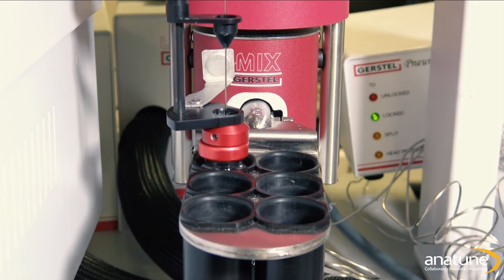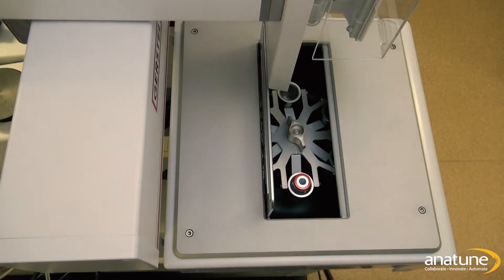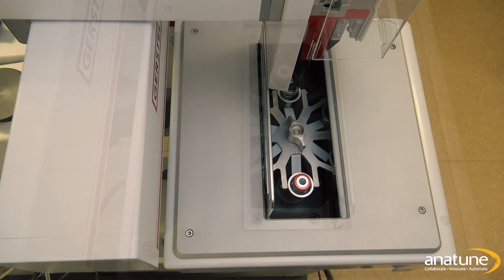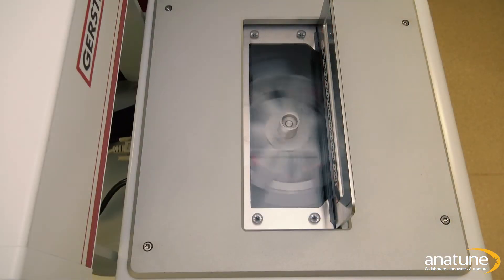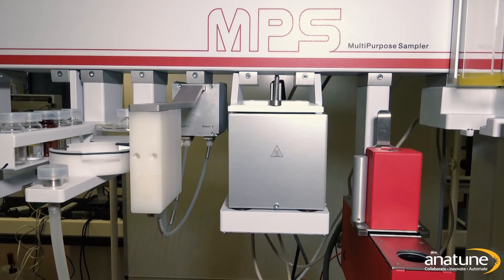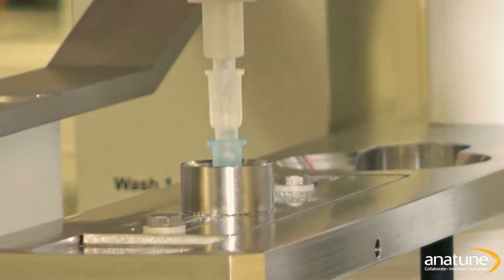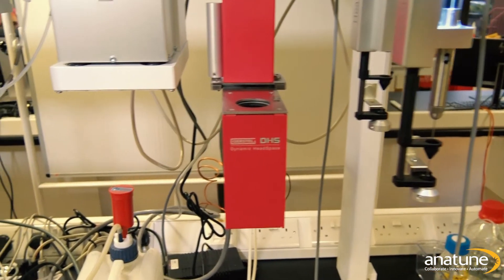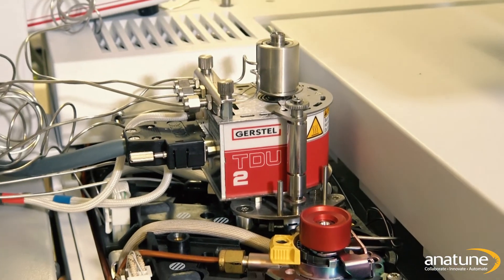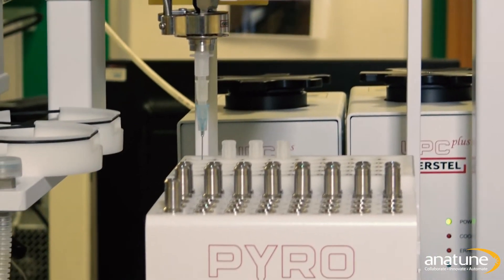That is where the Gerstel MPS comes in. This robotic rail offers the widest range of possibilities for automating the extraction of volatiles and semi-volatiles. It can easily perform almost every stage of sample preparation including automated liquid extraction with centrifugation, agitation, and filtration. It also employs different sample introduction techniques such as dynamic headspace, thermal desorption, and pyrolysis — all modular and all fitting on a rail to suit any analytical problem.